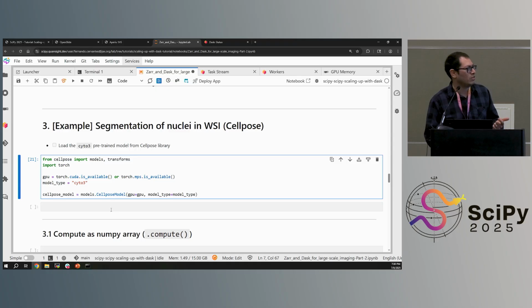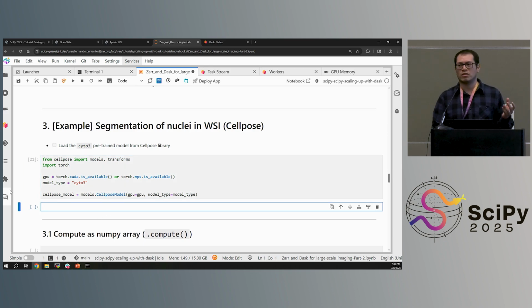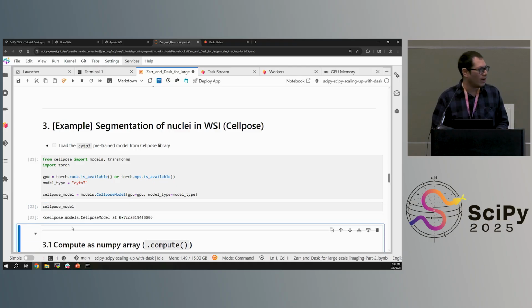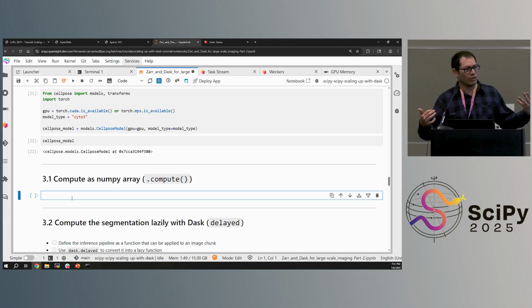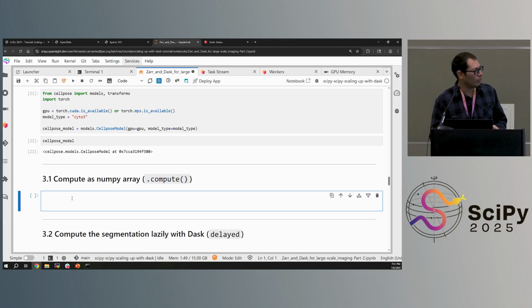So in this case, it's going to return 3 levels of thresholding. Your nuclei are the darkest intensity objects in your chunks. So you could take the first class and assign that as the nuclei object. So this is, at the end, just applying this conditional: if your intensity in a certain pixel is below this level, assign it a true. Otherwise, it's false. So you end up with a binary image mask out from here.